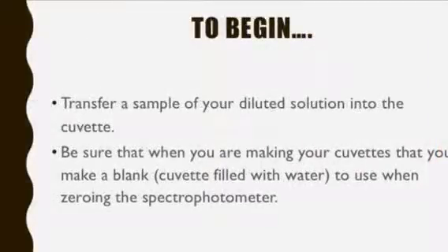To begin, transfer a sample of your diluted solution into a cuvette. When making your cuvettes, be sure to make a blank so that you can zero the spectrophotometer.